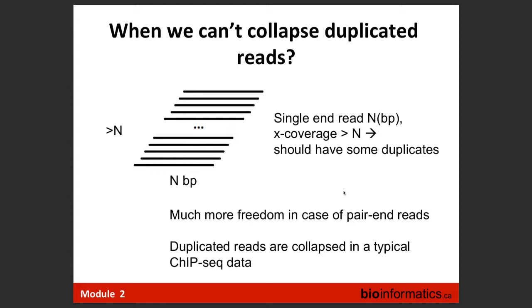When you say filter, it collapses. So it leaves one copy. So you have to do something. If you really want to get rid of them, you have to do some extra work. We can talk about this. If you need to do this, we can talk about it, but it's not readily available. So yeah, removing duplicates means collapsing them.